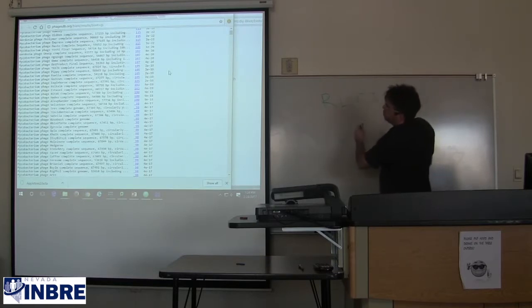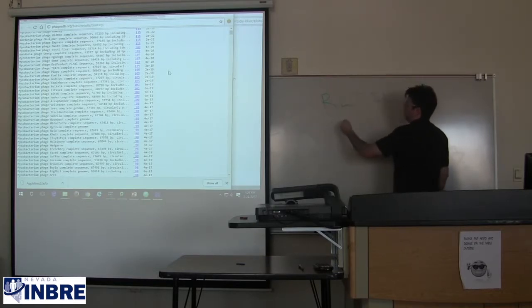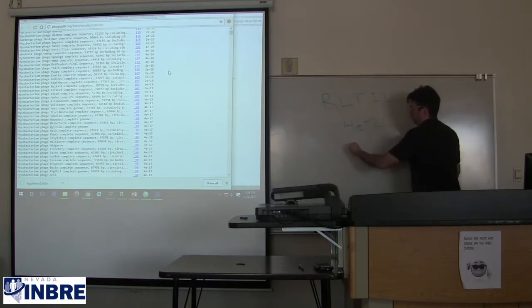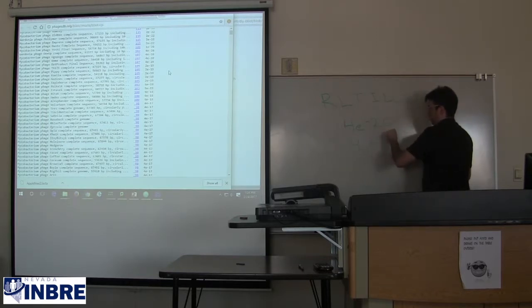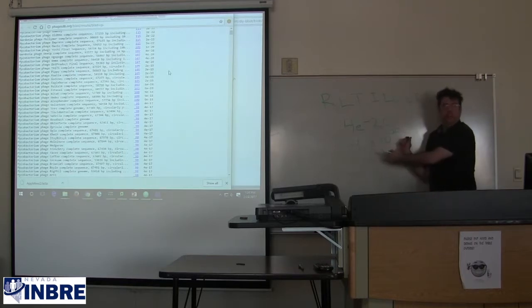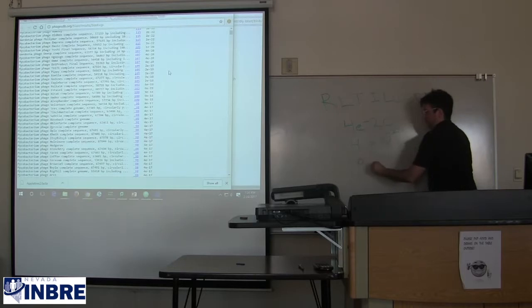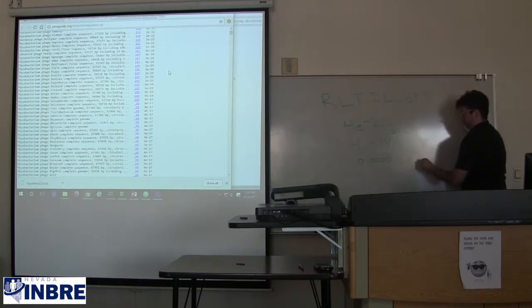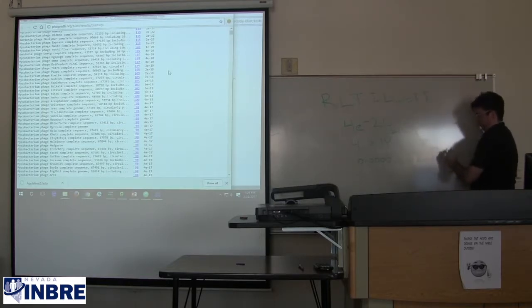If we go to, say, 4e negative 20, it means 4 times 10 to the negative 20, and it's just a more compact way of writing that. So that would be 0 point, a lot of zeros, 4. But not 0.